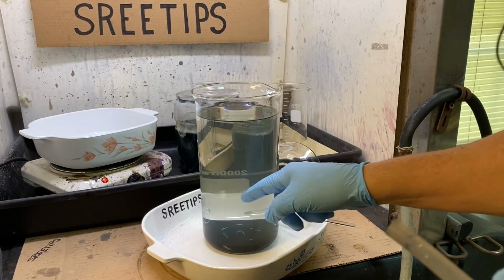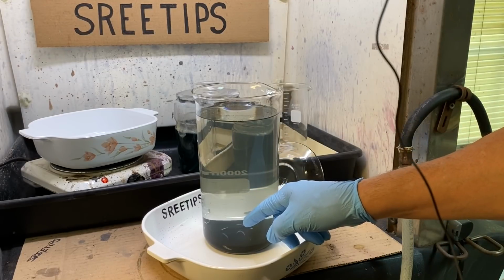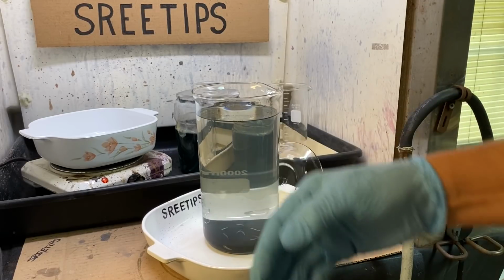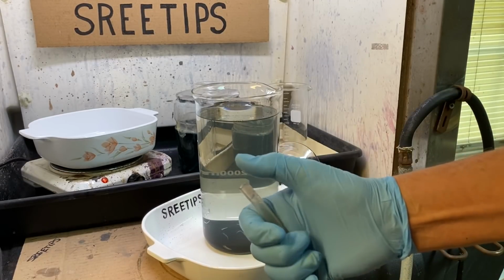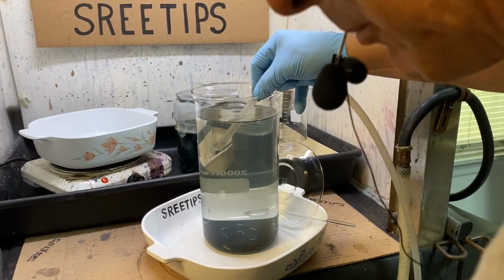Okay, I did a second rinse off camera and allowed this to settle again overnight. So it's been 2 days since I had my hands on this material. Now what I'm going to do is siphon the liquid off of here into a waste bucket.